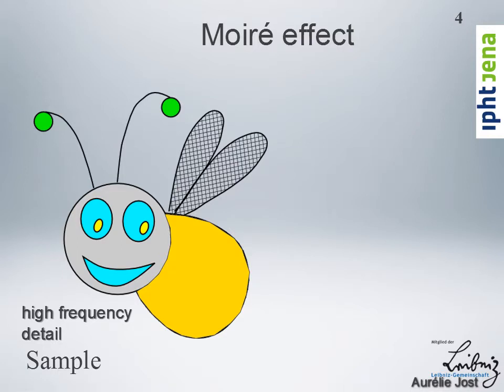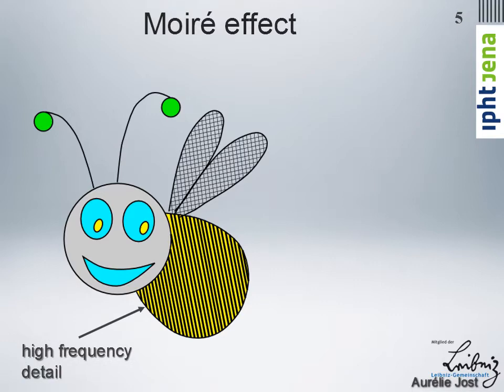However, before we image, we have the chance to overlap the fluorophores with an illumination pattern. And if we do so, something funny happens. There comes our illumination pattern.